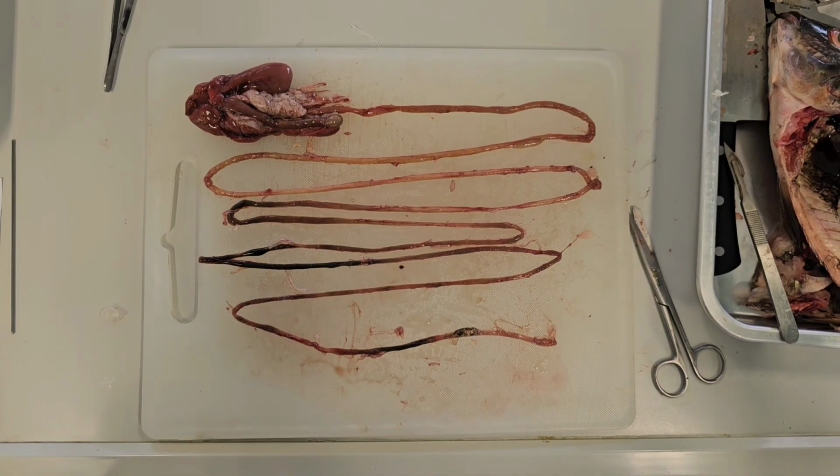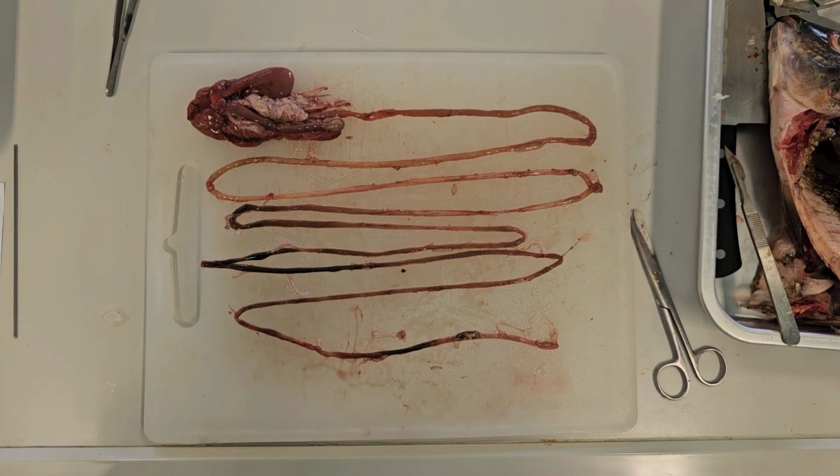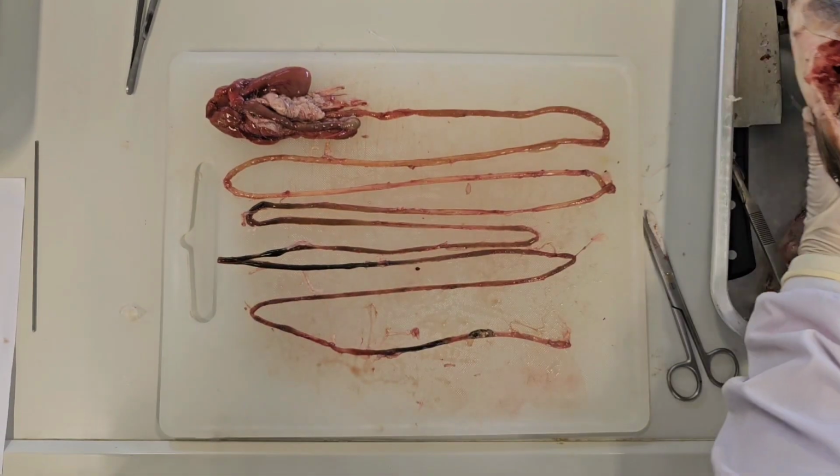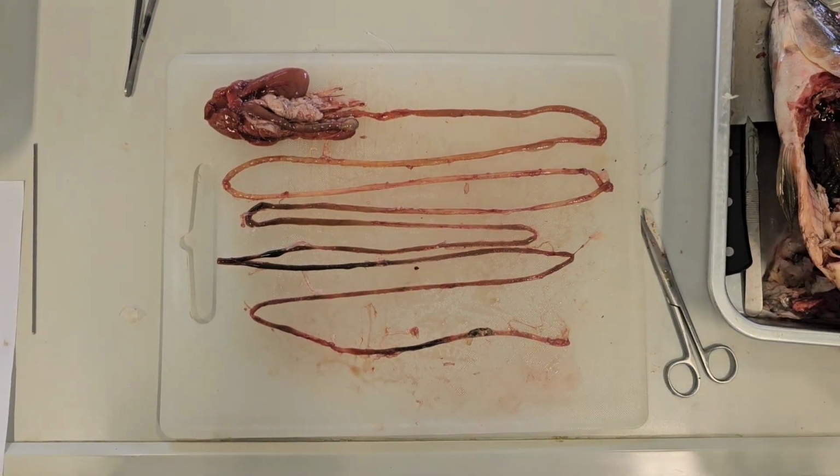Then there is the structure of the intestine that connects to the stomach. So if I take it out, you can see it is very long.